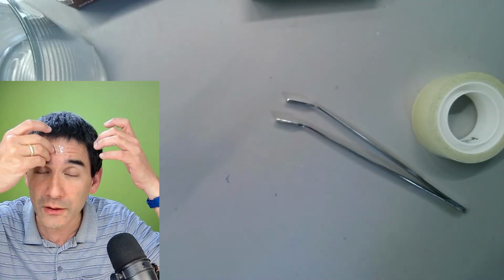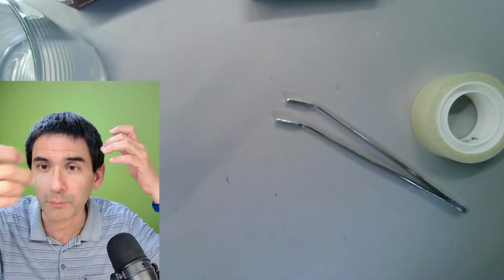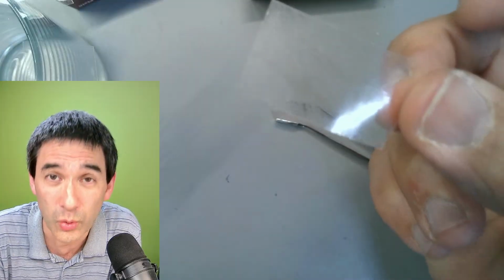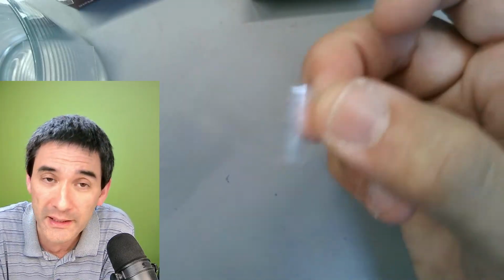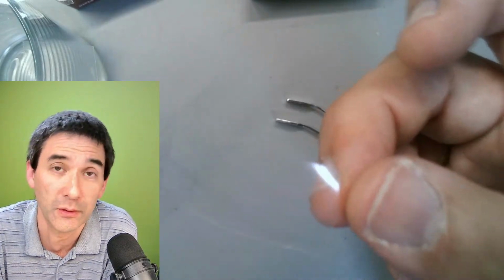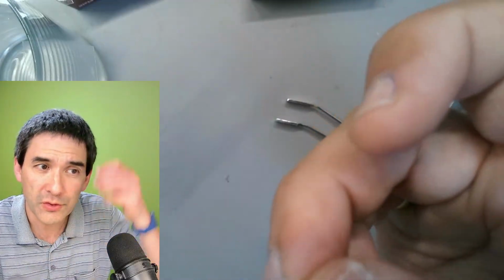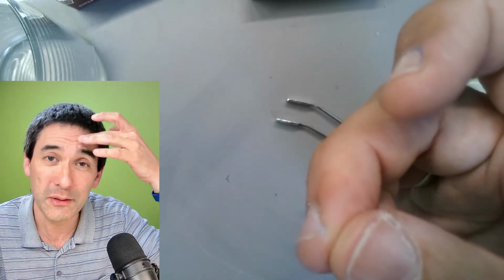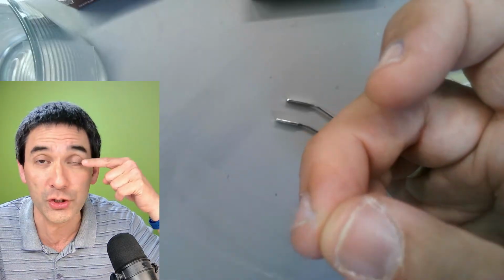Then you peel it off, and you hope that there are face mites on here, right? This method does work. I've tried it before, but it's very inefficient. So that means you have to make many trials just to find maybe a single face mite, if you're lucky. And I think the reason is because there are not so many hair follicles here. And maybe that's also not the place where you can find a lot of those, but you find quite a few of them in your eyelashes, right?